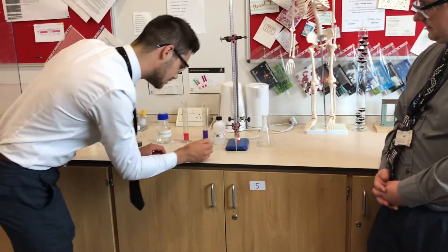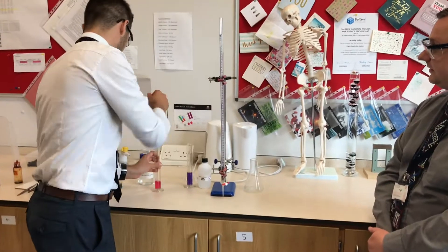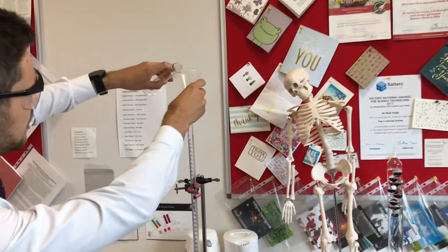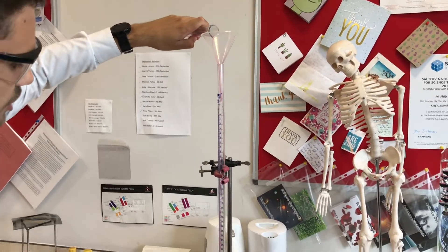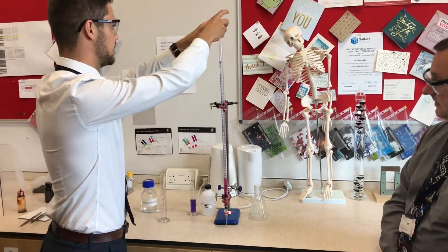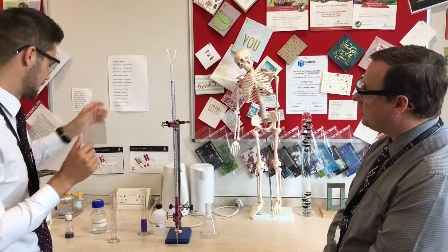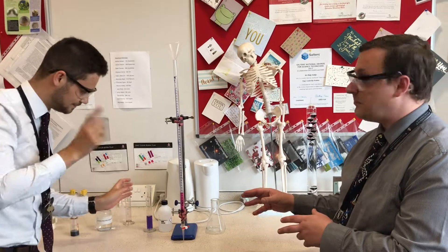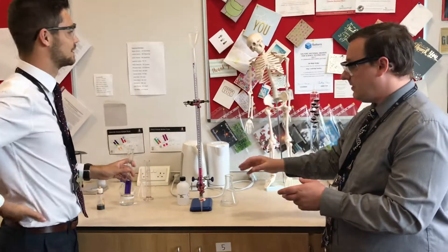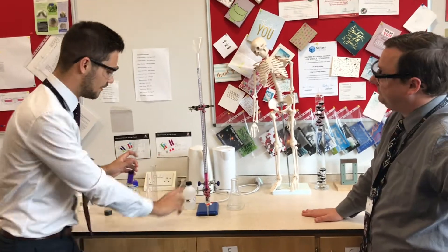Just checking the burette is shut — yes, it is. I'm going to add the acid first, just down to the bottom. Now I'm going to switch this round. Any ideas why, Mr. Walker? Well, I'm pretty sure you're following good practice of making sure things don't react before they're supposed to. Exactly — if you put that one in again, the carbonate would start to react with all the drops on the inside. You want it to react right at the bottom, otherwise it will ruin our fun experiment.